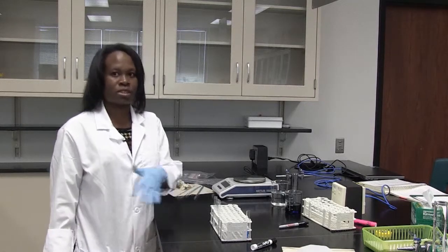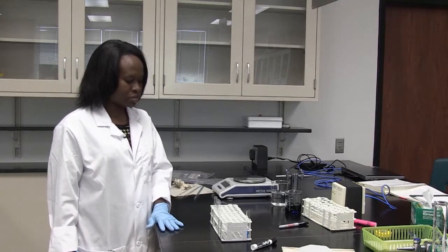The next set of dilutions that you will be required to do in the lab is a serial dilution. In a serial dilution, all the solutions that you make up have the same dilution factor. That is different from a dilution series, where the different dilutions that you make up have different dilution factors. So that is something important to bear in mind.